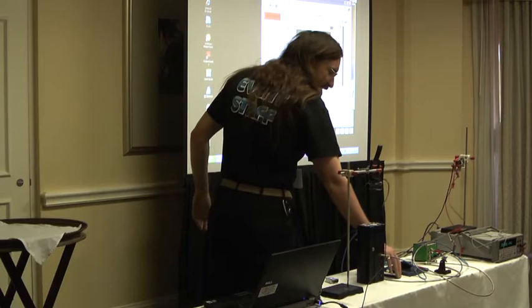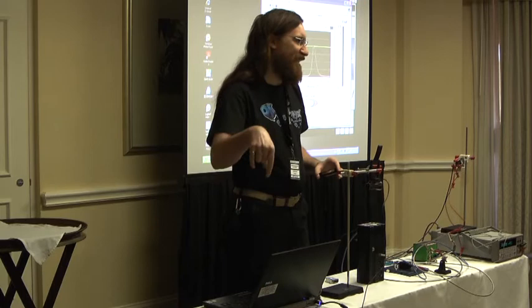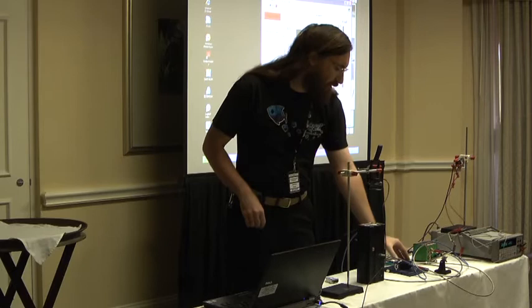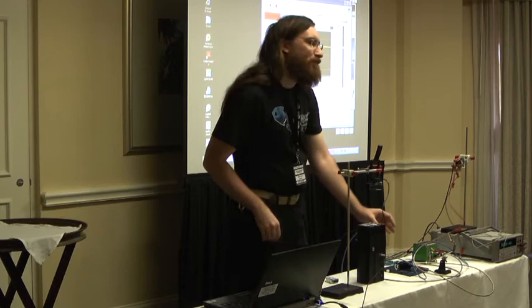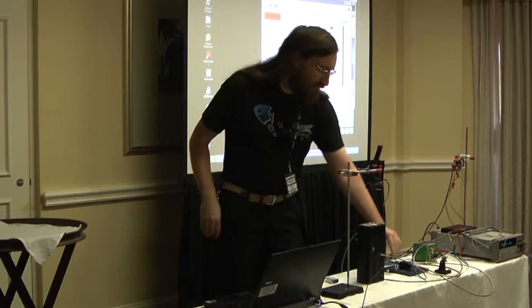As I introduce something in the light path that is going to block some of that light and knock that peak down a little bit, the voltage — which is tied to the pitch of the sound on the laptop — will be increased to keep that spectral peak at the same intensity. So as I vary this, you can see that the gain will change.